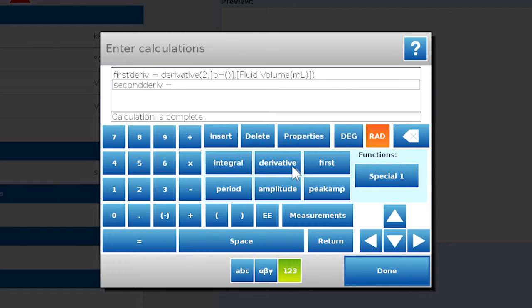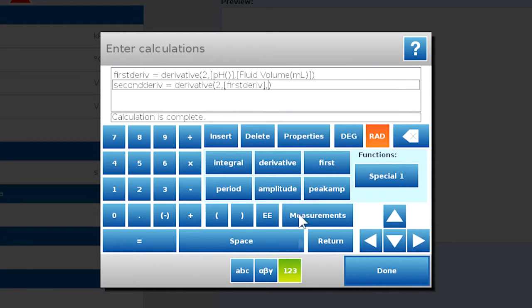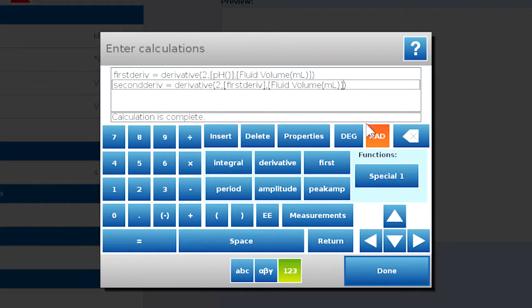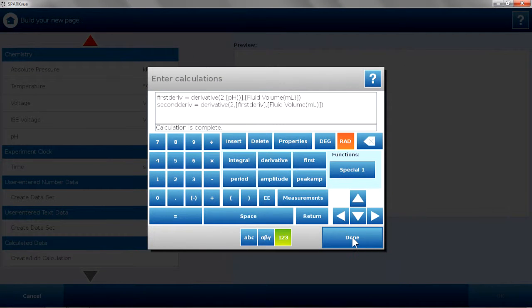And now I'm going to do my second derivative. And this is going to be a derivative of that first derivative versus fluid volume. And those calculations are complete, so we'll hit done.